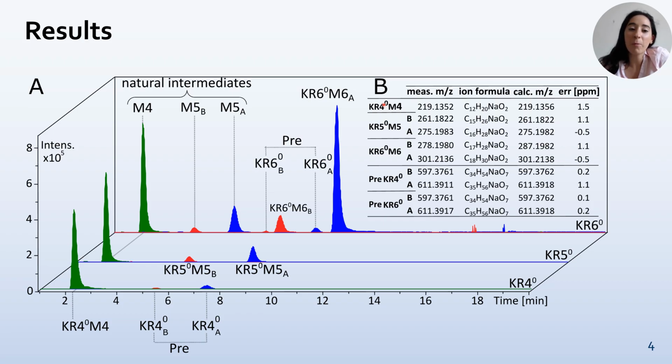Right now, we are working to expand our work to untargeted, to see up and down regulated pathways not only in secondary metabolism, but also in primary metabolism.